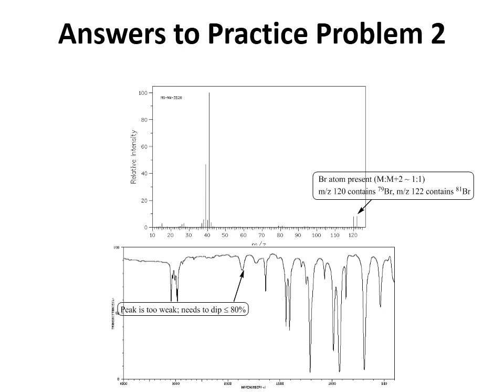But the peak that comes after that is substantially larger. It has a range between 1600 to 1680 wave numbers. Therefore, it's a carbon-carbon double bond. It's not an amide because nitrogen would make the mass odd, so we're going to claim that this is a carbon-carbon double bond.